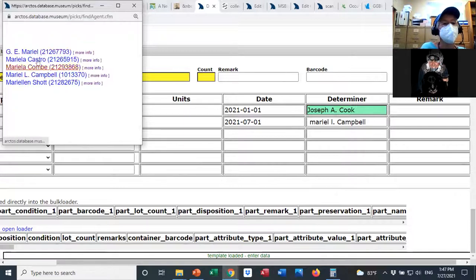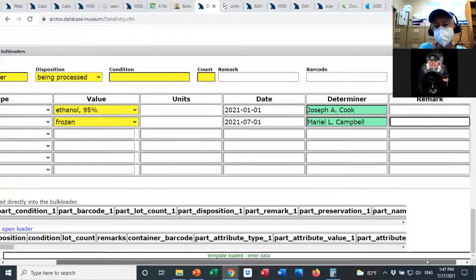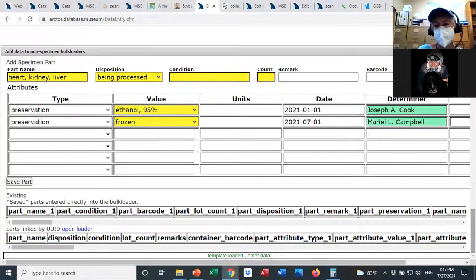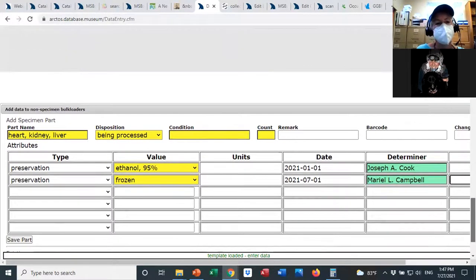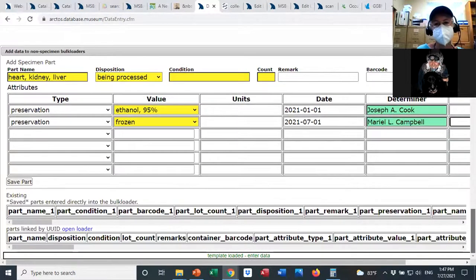Everything goes to the code table and I have to pick the right one. This helps minimize misspellings that impede discoverability later.